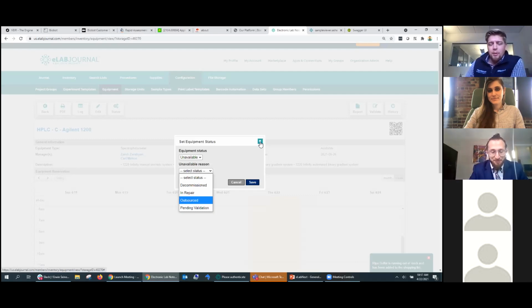Yeah. And the other thing I would say is, a lot of times the equipment might have a longer life in the lab than an employee, right? Lab ops or somebody that might have been involved in some of the repairs that happened 8-10 years ago. Having it documented just helps put the pieces together when you're going to make those decisions. It was a call I had yesterday or the day before, and I'm just thinking, wow, wish we had that history, because everybody's going off he says, she says, and we're trying to put the pieces together, and something like this would have been key then.